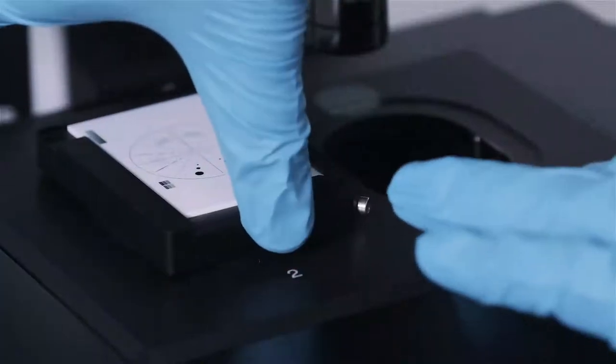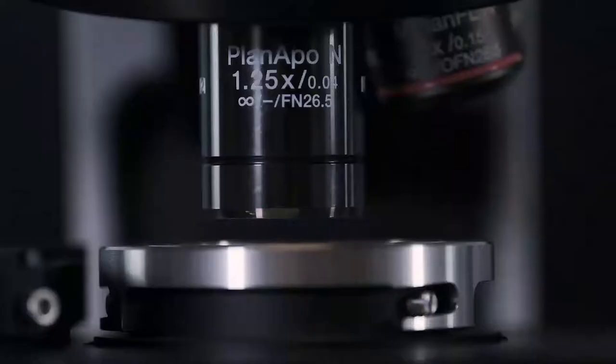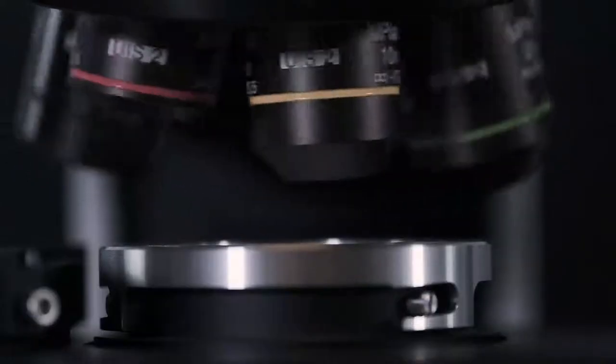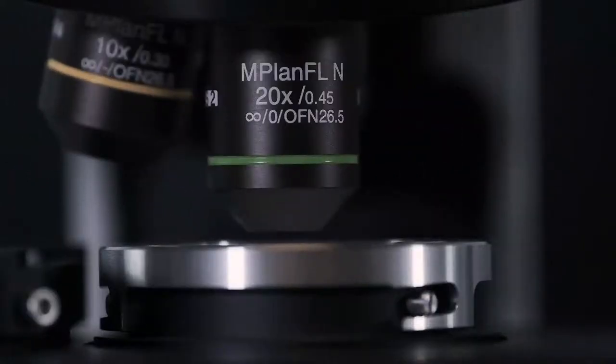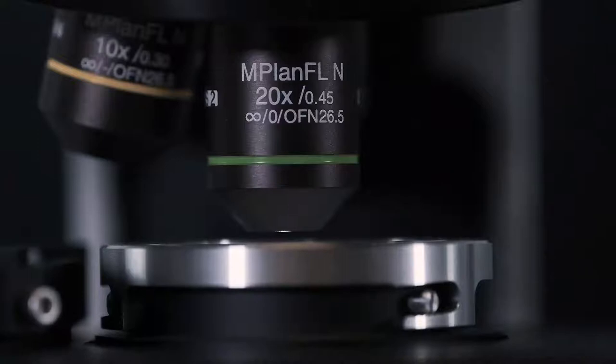Simplify your technical cleanliness. Experience a new level of speed, performance, and reliability.